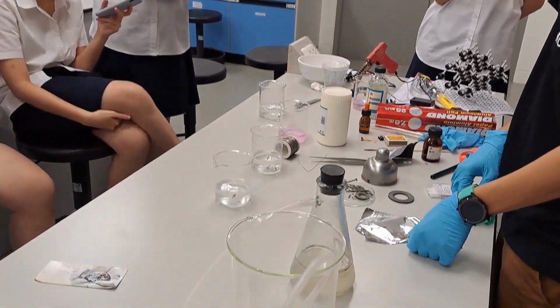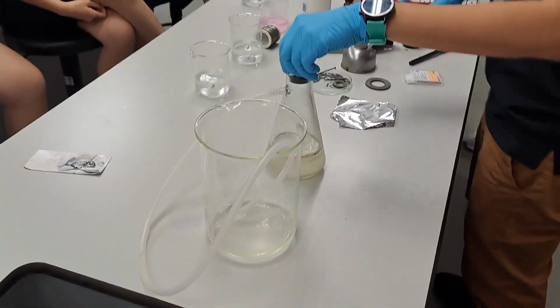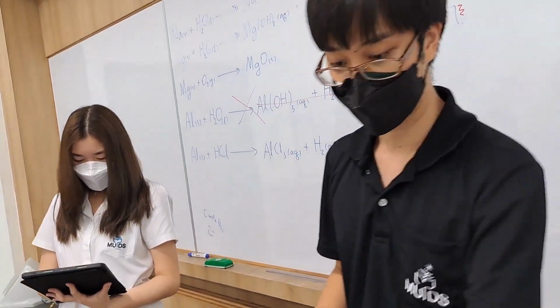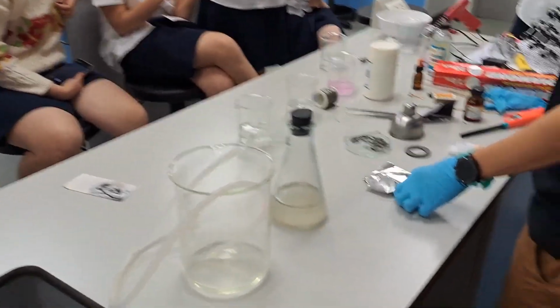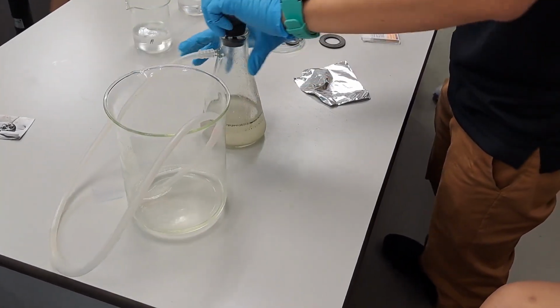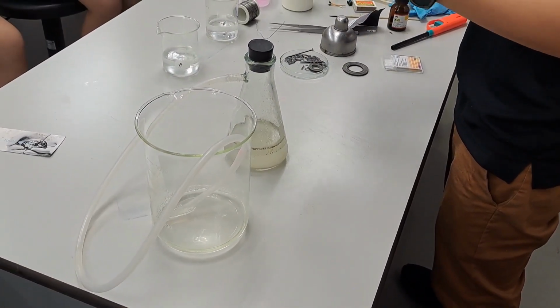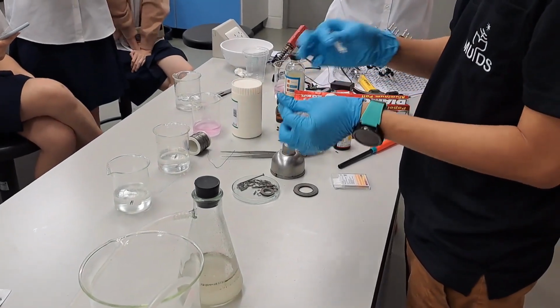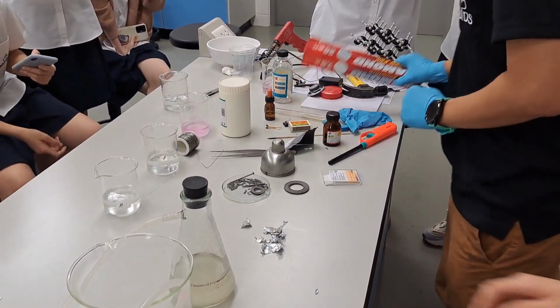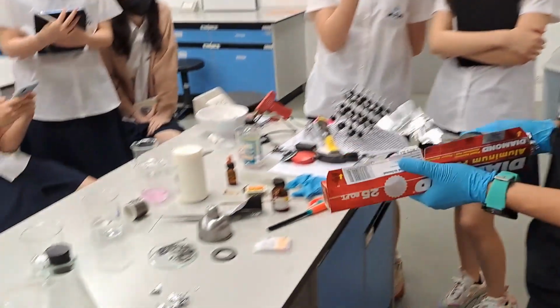Group 7. Let's do a demonstration with this, and this is about the reaction here. Inside here is hydrochloric acid, and we put aluminum in, and we will see. In this beaker is water with soap, detergent. So when gas forms, it will be trapped inside bubbles, because there's going to be one gas forming. Let's have more aluminum.